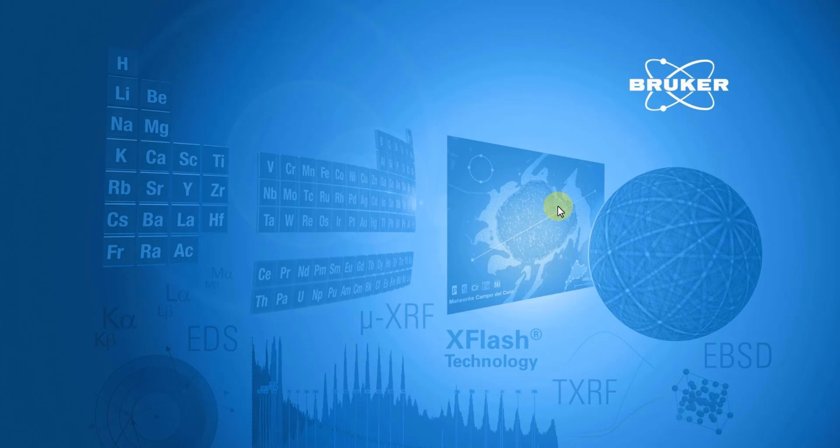Hello and welcome to the support tutorial video for Bruker handheld products. This video will review the library matching feature in Artax software, and this feature allows the user to build a library of known reference materials and find the best match for unknown samples.